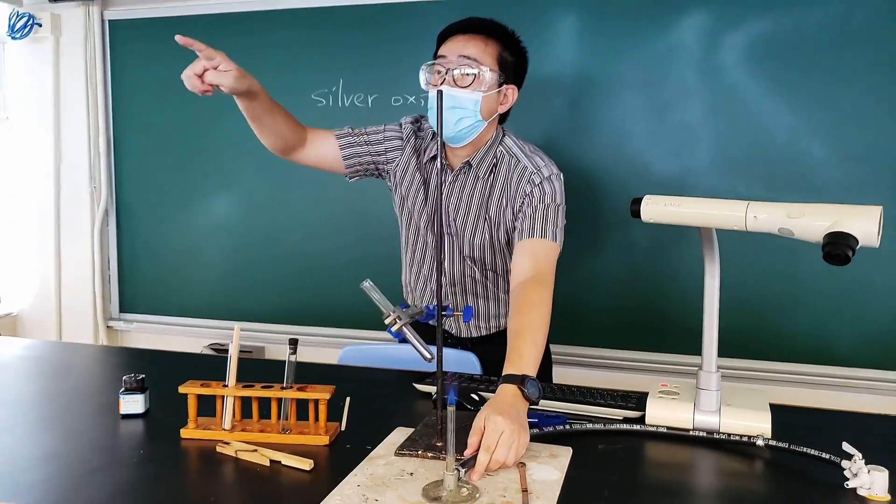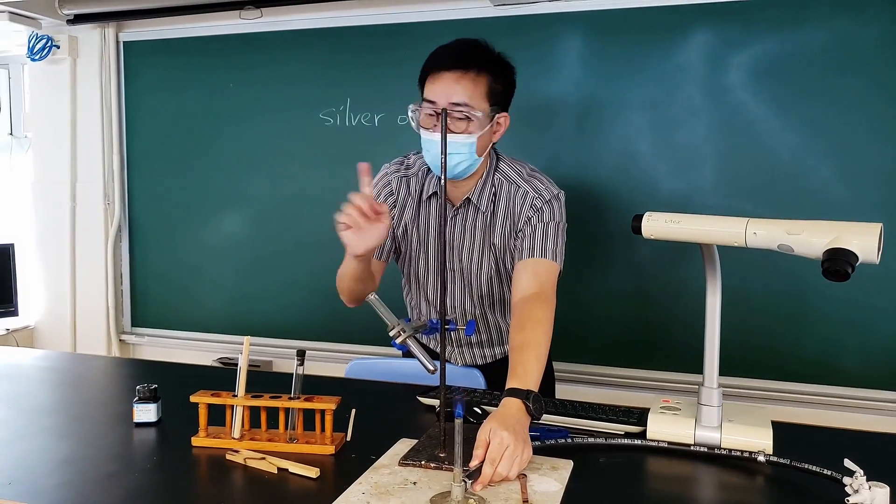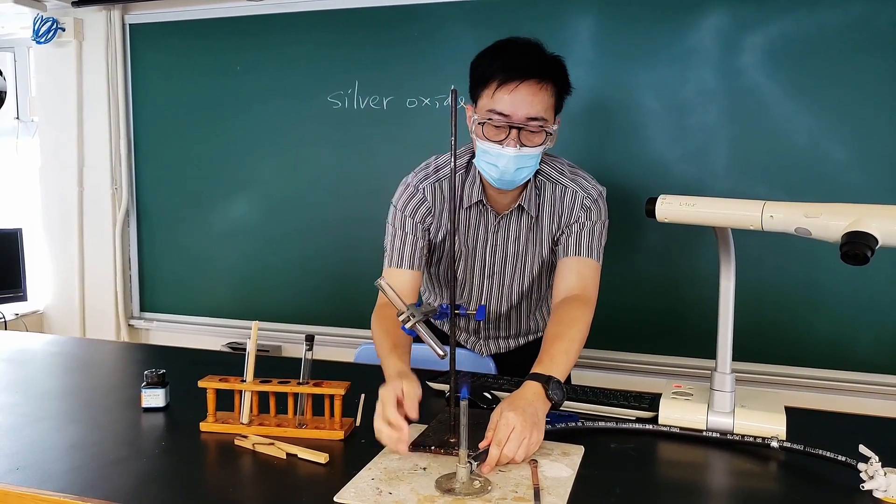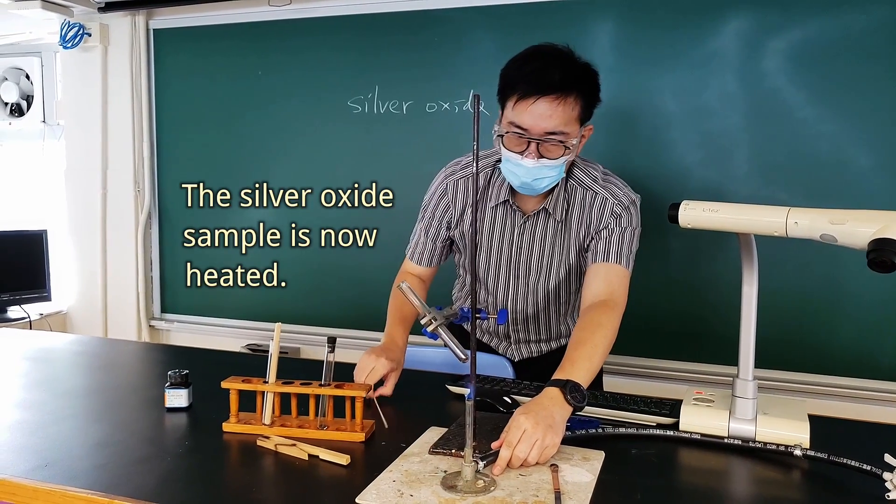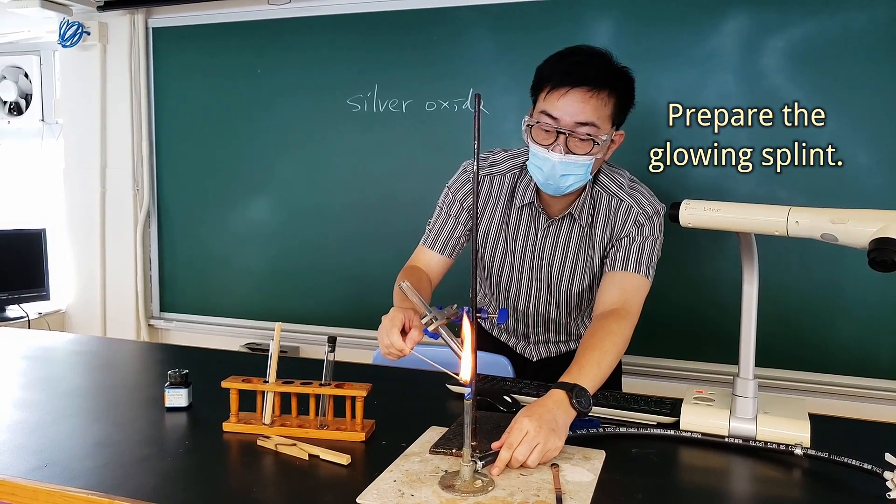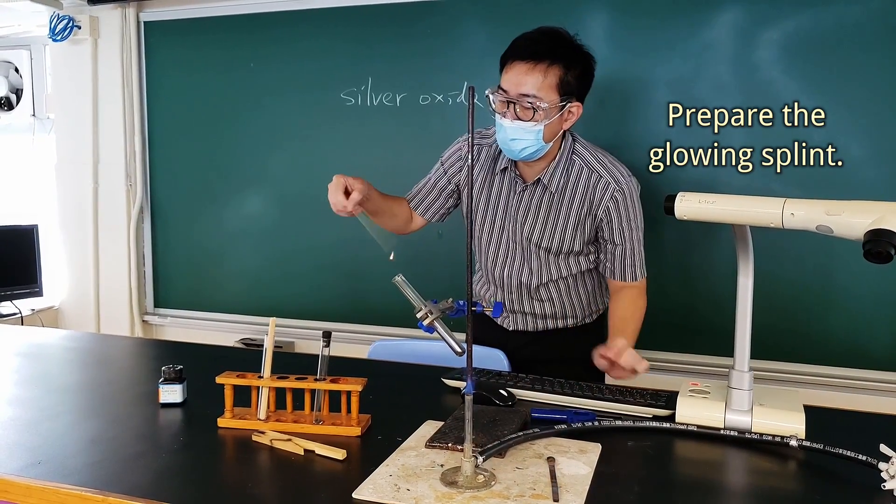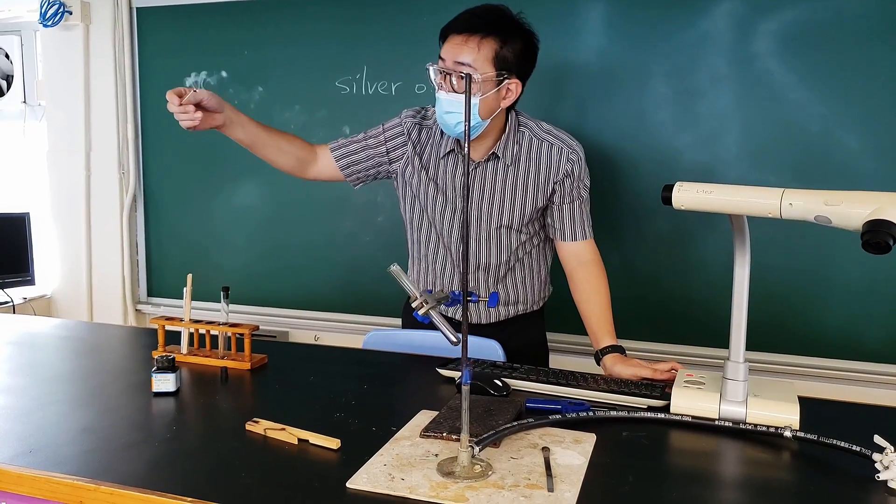Okay, so please note that the silver oxide is still not heated for the time being, black in color. I am going to heat the silver oxide. While I am doing this, I will also prepare the glowing splint. I hope you still remember how to prepare the glowing splint. It should be like this.